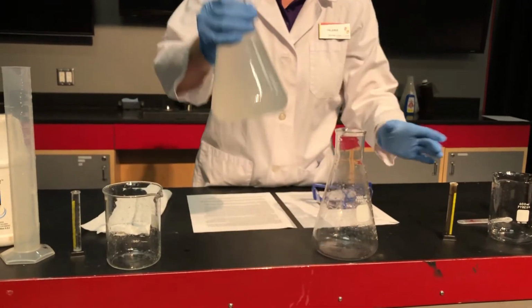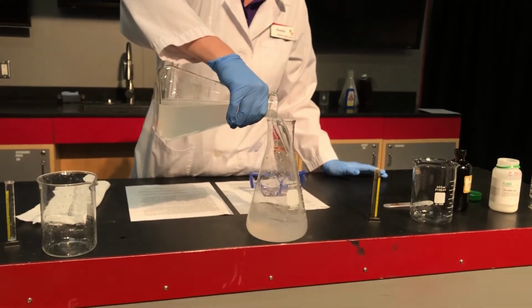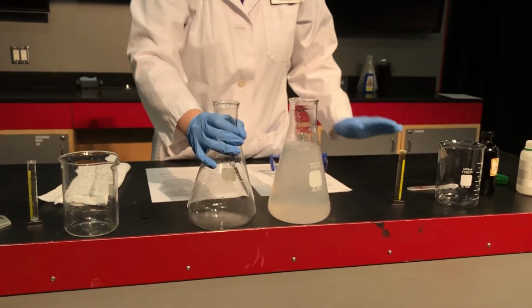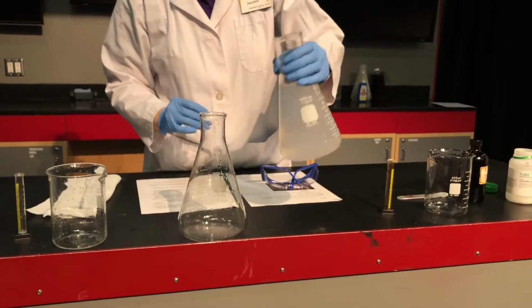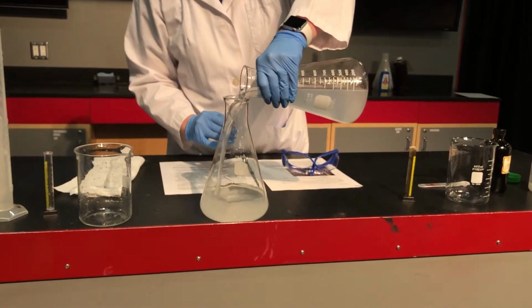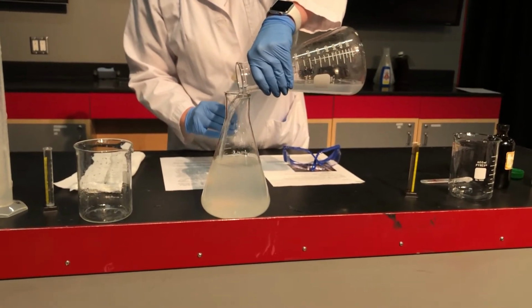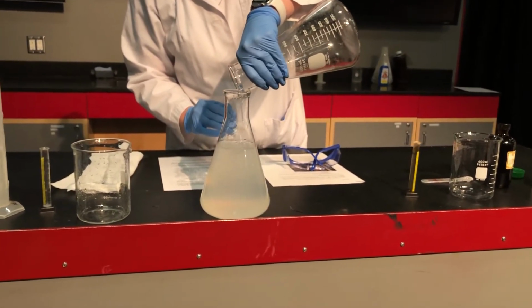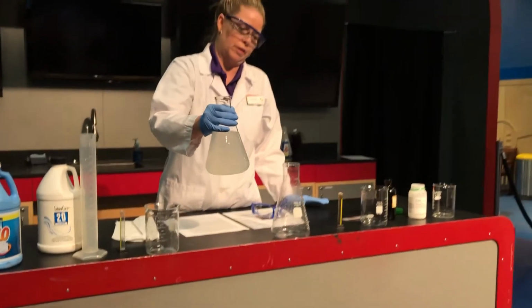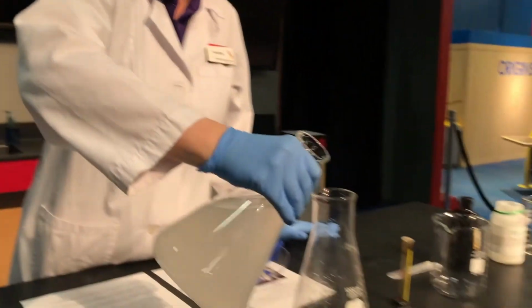All right, so still looks the same, still kind of a, what do we call that? Cloudy, clear liquid. Hasn't changed yet. We're still looking to see if anything has changed. You can also just let this sit and see when the reaction will start. It's something that does take a couple of minutes. So as we're pouring it back and forth, we're looking for a change, for the iodine to interact with our other chemicals and to turn a different color. You see a different color yet? Nope. All right, we'll keep pouring here.